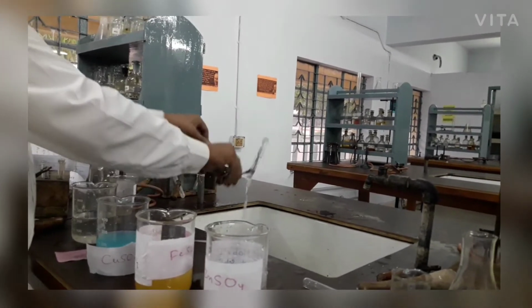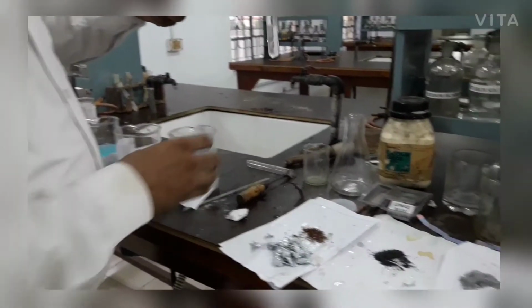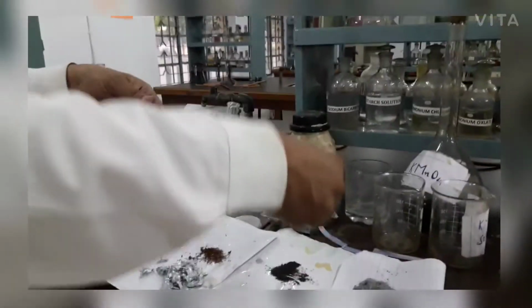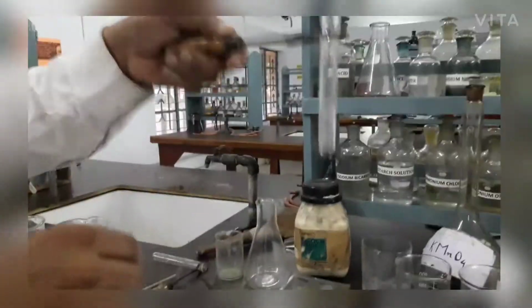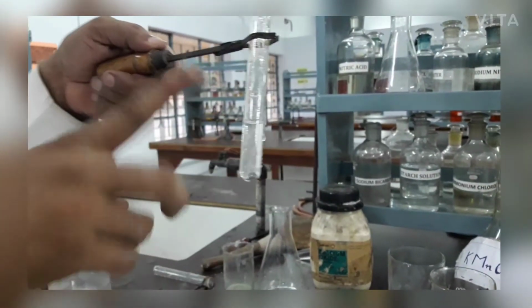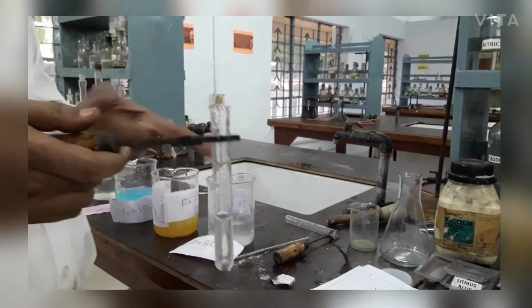Again, in the same solution, zinc sulfate, we add now iron. And we observe. You see, no reaction, no change in color. Means iron is not reacting with the zinc sulfate, because iron is less reactive than zinc.